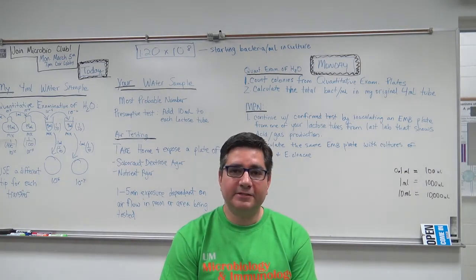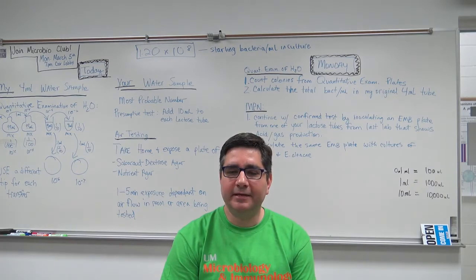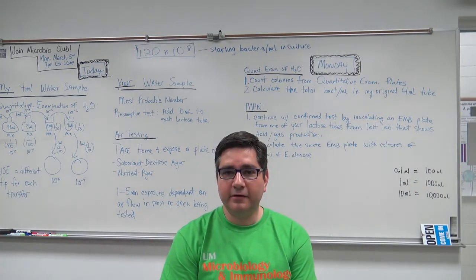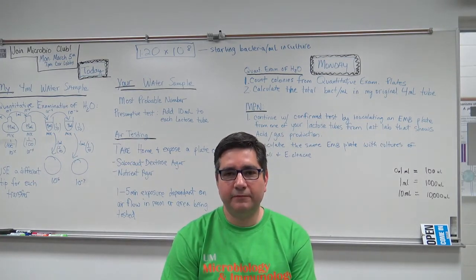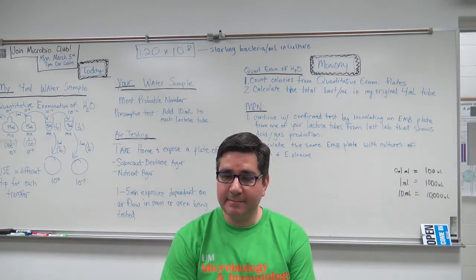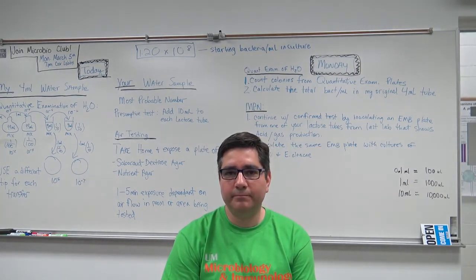The last test you'll be doing in this exercise is that of air quality. This part of the exercise is a take-home assignment. You will be given 1 plate of nutrient agar as well as a plate of Sabouraud dextrose agar. The nutrient agar, as you know, is a general purpose agar, and the Sabouraud dextrose agar is enriched for fungal growth. You can either place both plates in the same location or in different locations around your home.